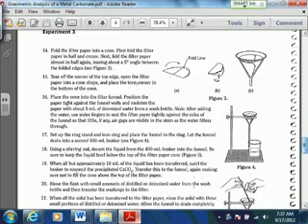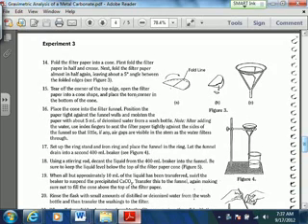Oh, okay. There is one thing here. Now, I may have to tell you this in class too, but they have you tear a little corner out of this filter paper, and what that does, it supposedly helps it to filter a little bit faster. And I'm not sure exactly what the physics of that is, but evidently that does help a little bit. So I think that's why they do it.